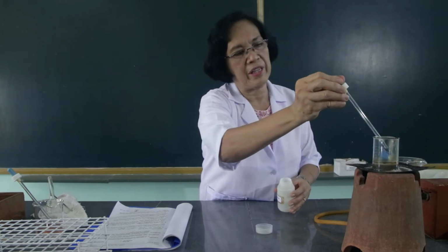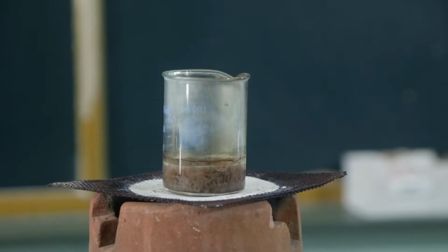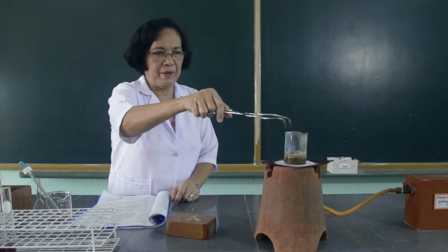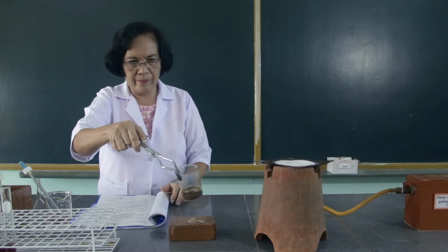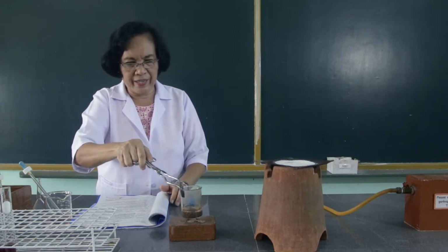And we are going to continue this boiling. Then we're going to remove this out from the flame. We will cool this for a while and filter it.